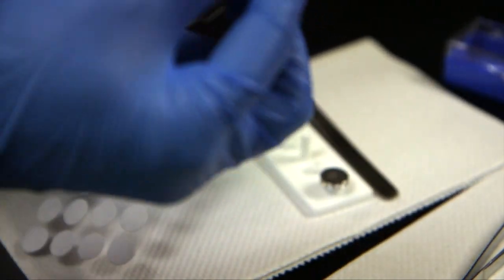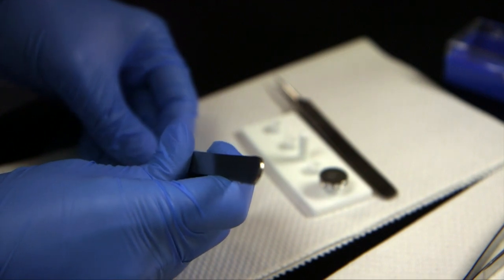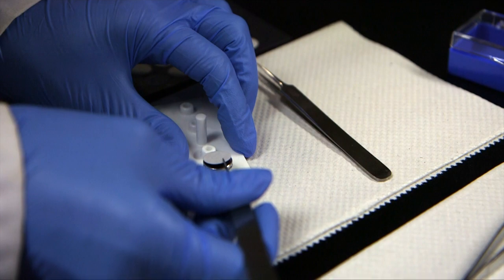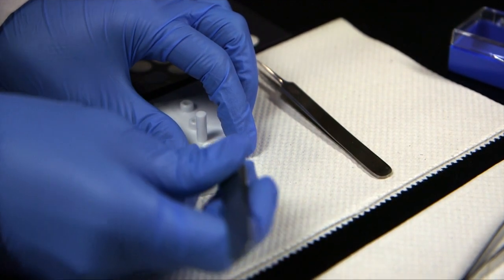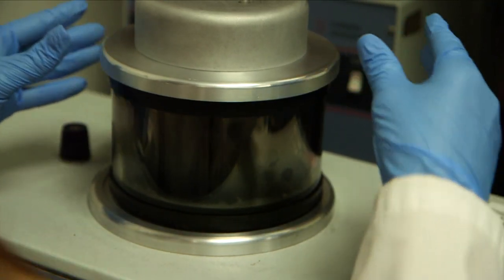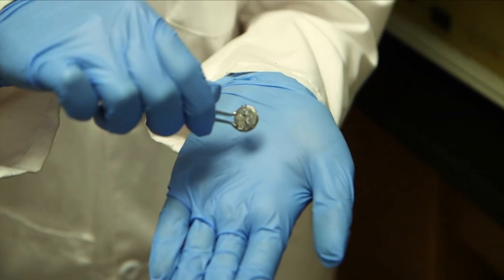Samples for the electron microscope require unique preparation. I just take double-sided carbon tape to adhere the sample onto the stub. The stubs are then coated with a thin layer of metal — we need to coat it with a conductive material, and in our lab we use an alloy of gold and palladium, so that there's no charging under the electron beam.